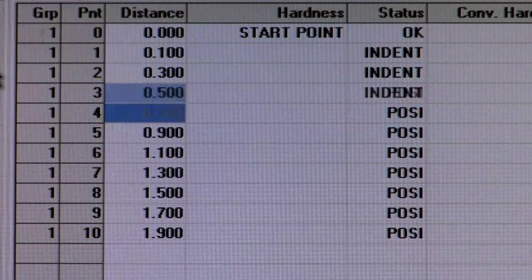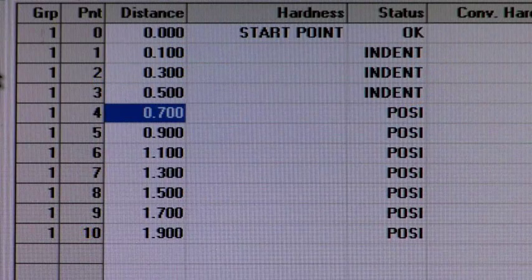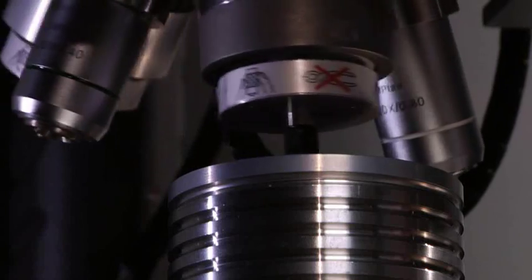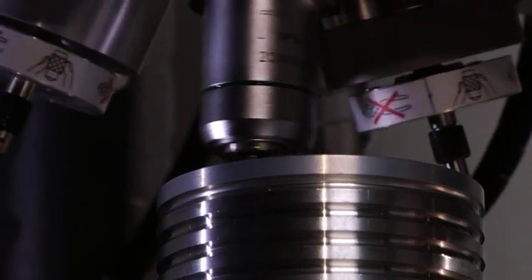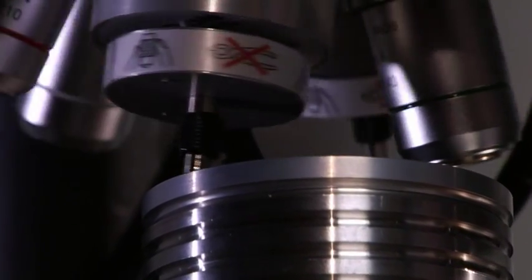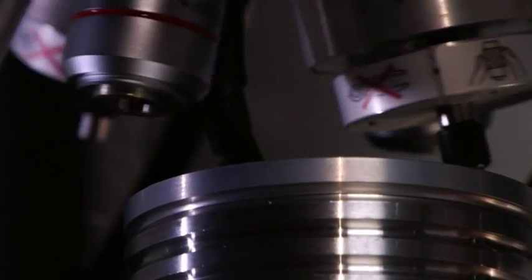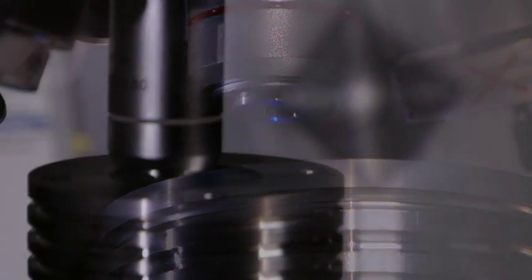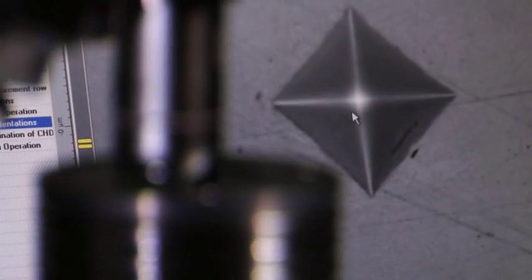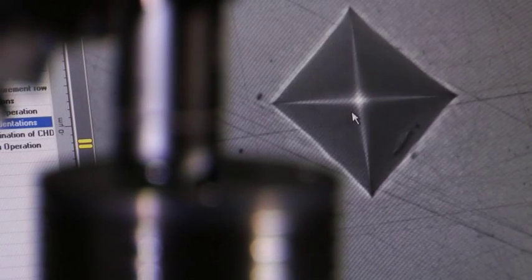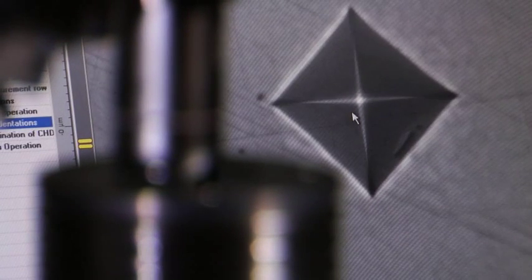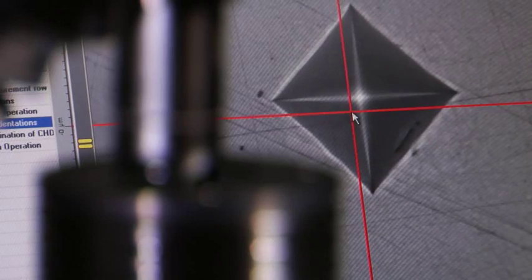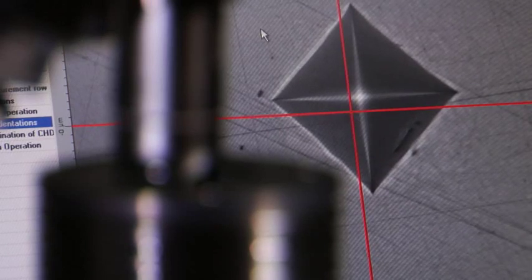The Toucan 2500 under program control will automatically perform a number of tests at predetermined specimen test locations. Upon completion, the motorized stage will move back to each indent for quick automatic measurements.